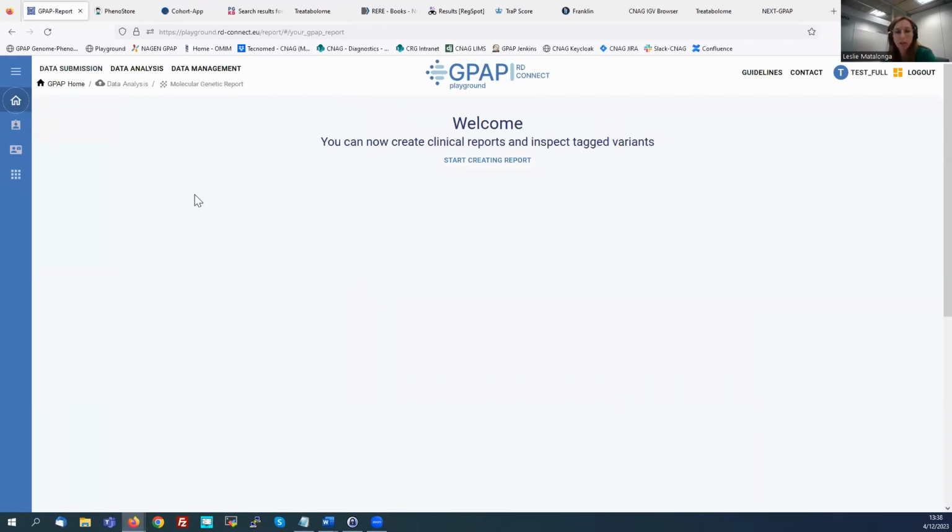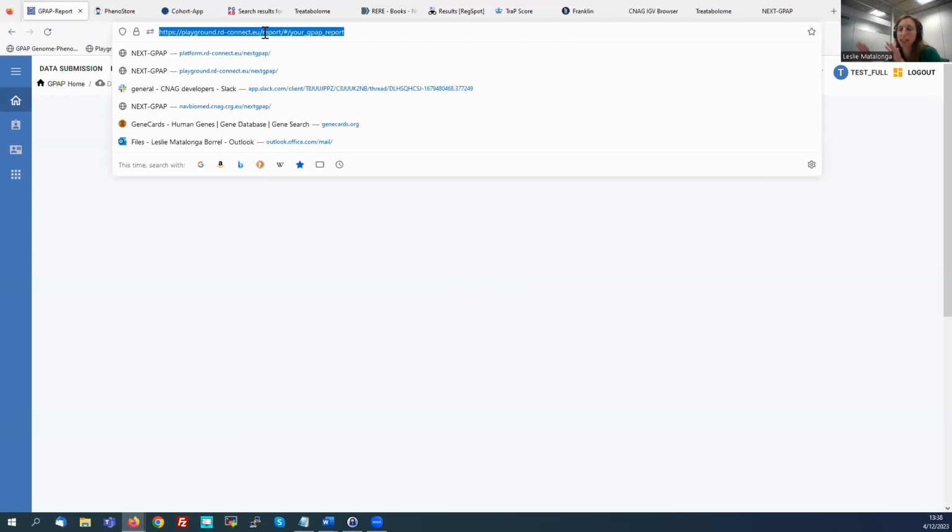Yeah, so I don't know now if there are questions in the chat, or there are specific things that you could not find and you want us to look at to understand where the information is now, because we have changed quite a lot how you see the data.